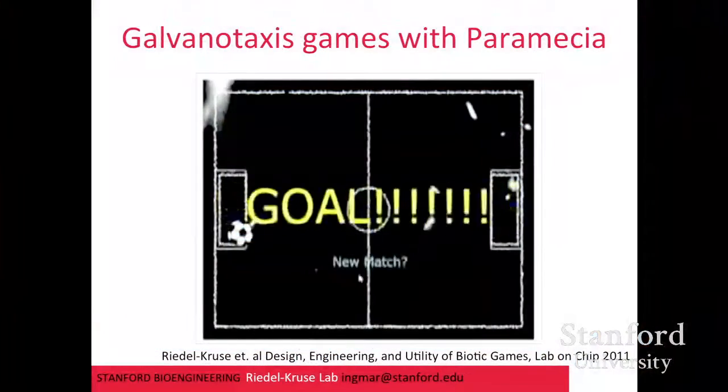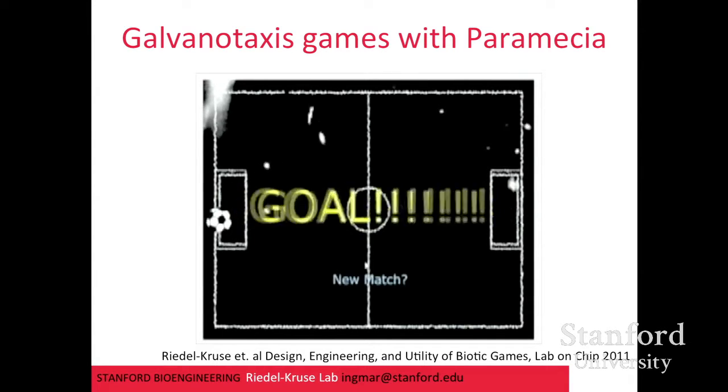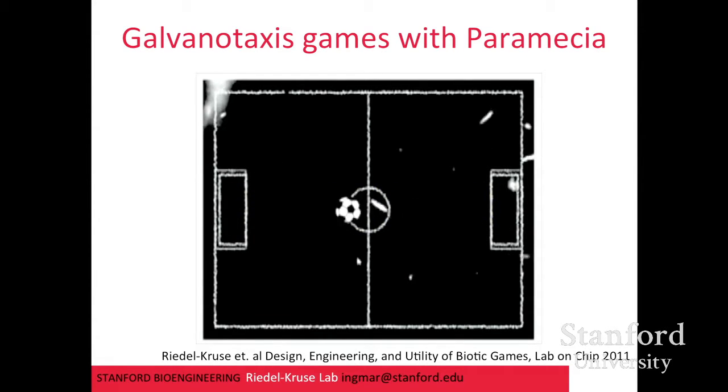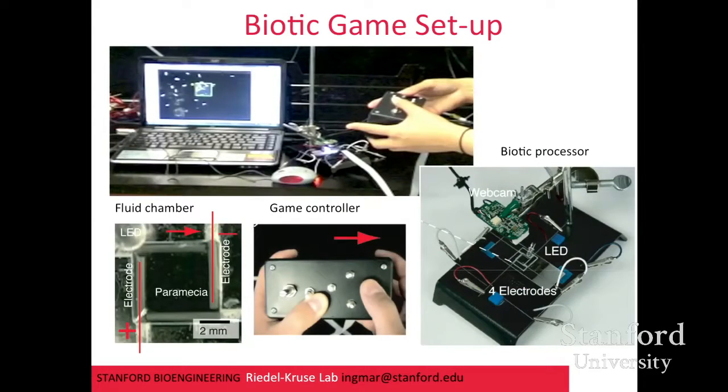So if you now just change the skin of this, like putting other objects on top of it and changing the logic, then you can make other games, so to speak, right? So you have an underlying game engine, if you want to say. But in that case, the game engine is something real. It's real cells, okay? So here again, the device is rather simple: this microfluidic chip, a simple webcam, and then just brought on a regular computer, and then putting some abstract objects on top of this. So what could we now do with that, and where should one go?